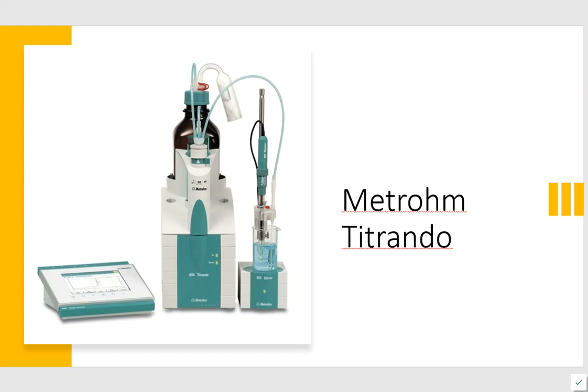So what will happen is that for this part of the lab experiment, you will take your KHP sample. This will be like number 5. After you do 4 of them by hand, you'll take a 5th one. And then you'll take it over to our titrando into another room, and you will titrate that KHP sample using the automatic titrator. So I'm not going to go into the details with this right now. We will do that one-on-one with you as you venture over and begin to use this for the very first time.